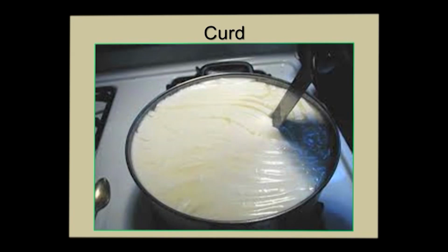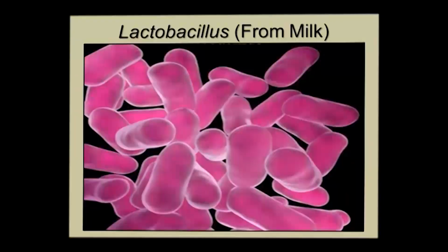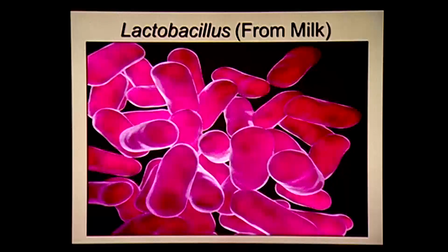Curd may contain a host of different bacterial organisms, of which there may be lactobacillus, lactococcus, pediococcus, and streptococcus. But lactobacillus is the most important organism present in curd, which is gram-positive in nature, rod-shaped, and at the same time catalase negative. So it can easily be identified.